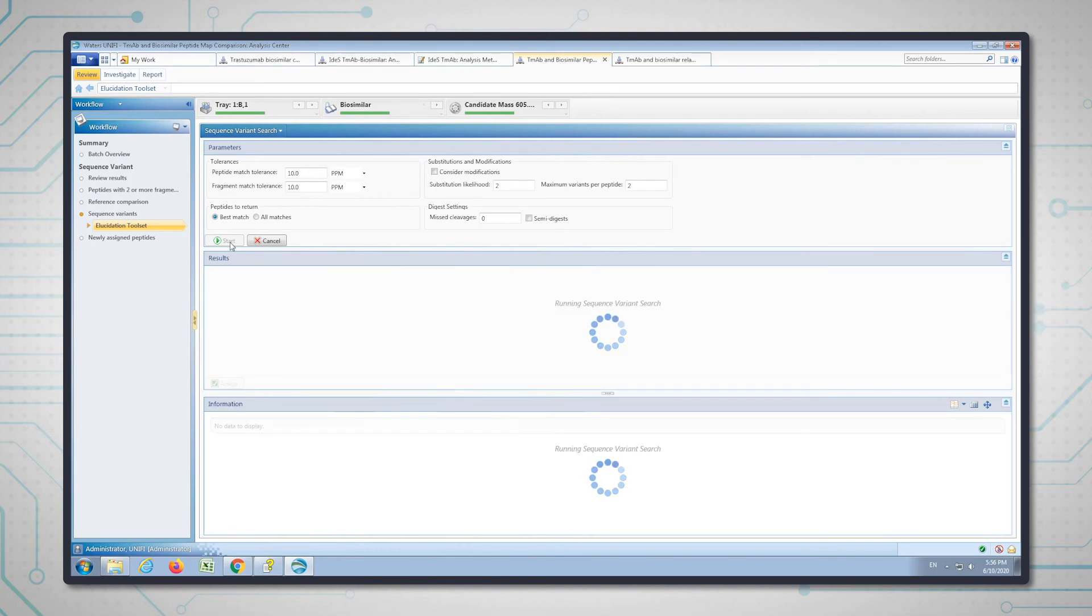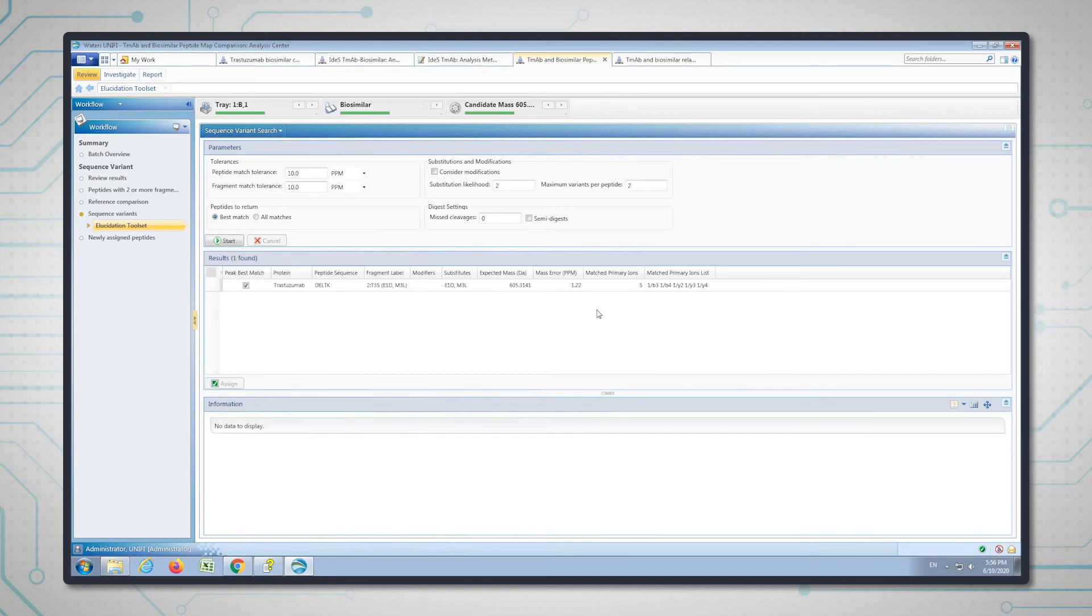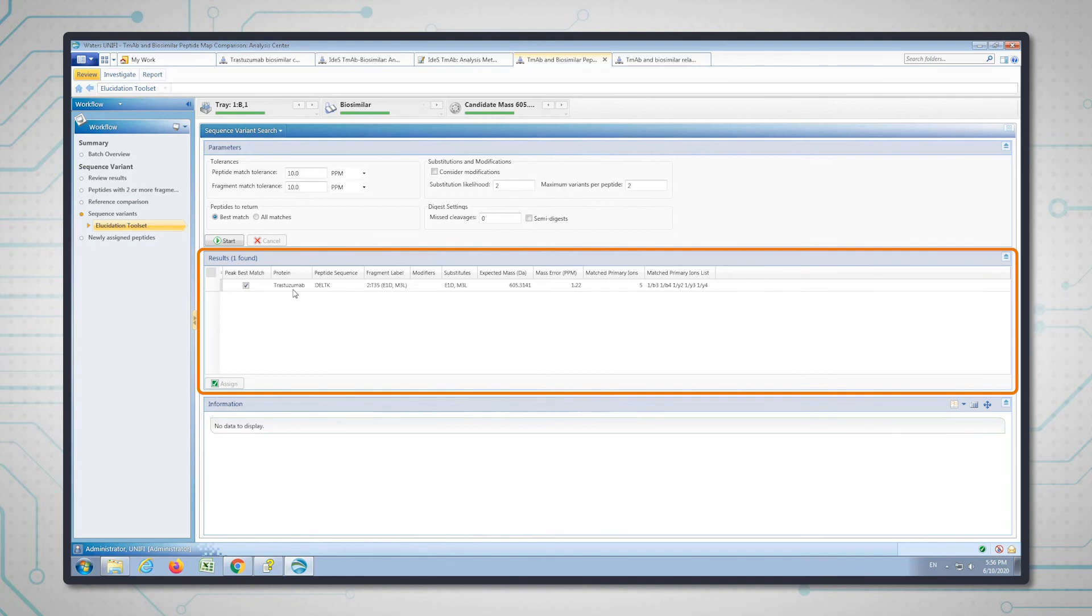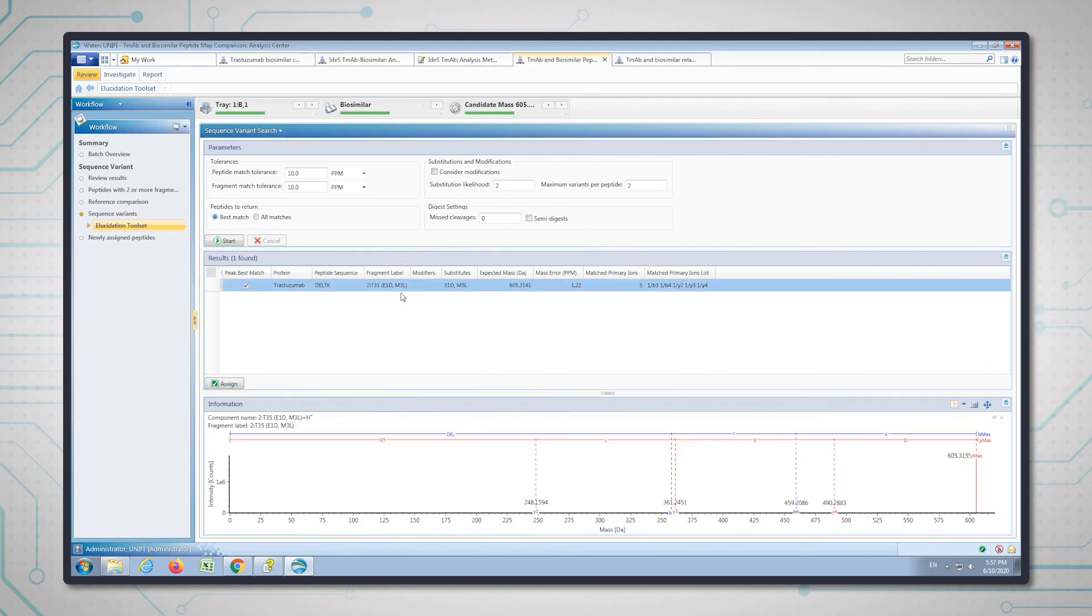Again, the same process is going on here with the list of in silico tryptic peptides and the amino acid substitutions. This time on tryptic peptide 35 on the heavy chain, which is what the two means there, there's actually two amino acid substitutions: there's an E to a D and an N to an L. And again, we have the B and Y ions to confirm that. I'm going to assign that.